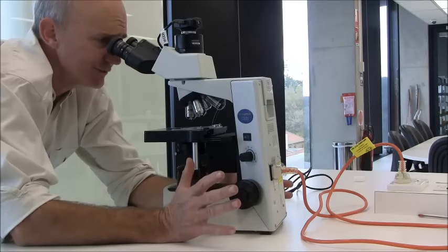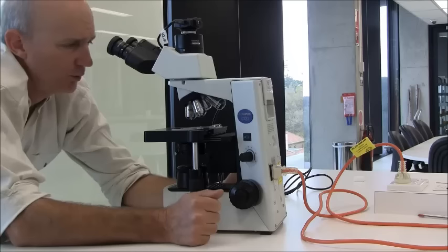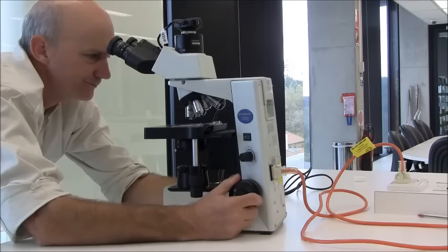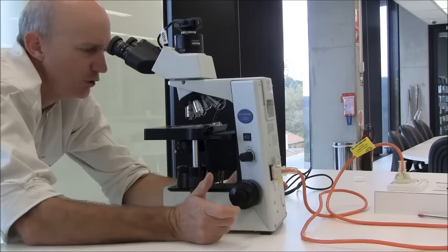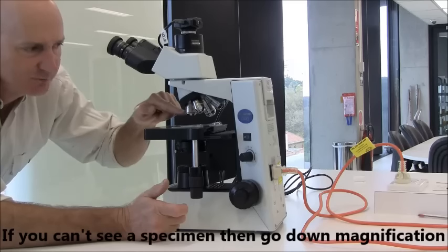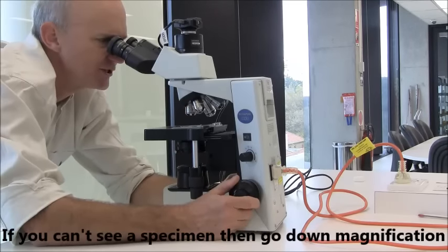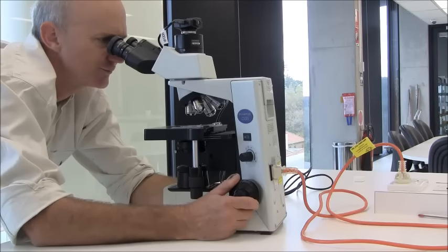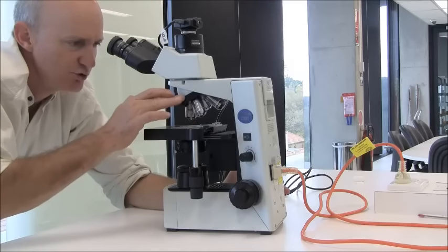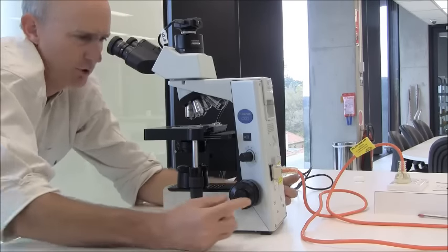If that happens, and we get a lot of students saying, I can't see anything, well, what you should do before you call over a demonstrator is rotate the objective lens back down to its lowest magnification and search for the specimen again and refocus. You center it and then rotate it to the next highest magnification and you should be able to see it.